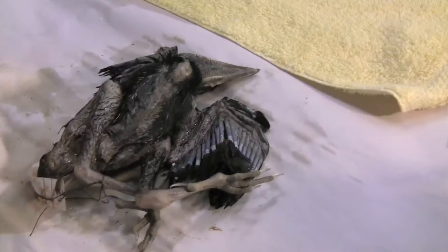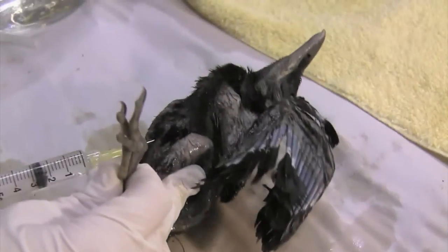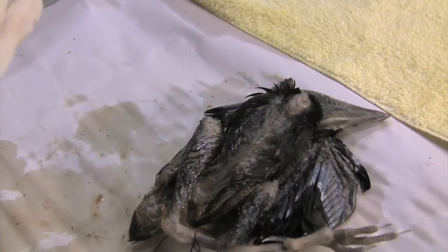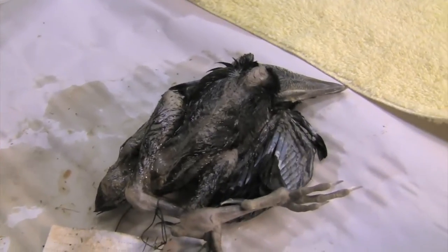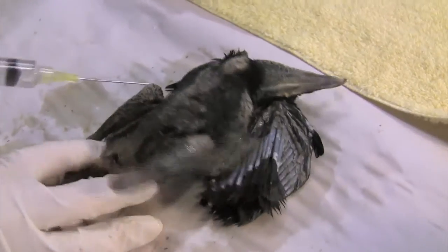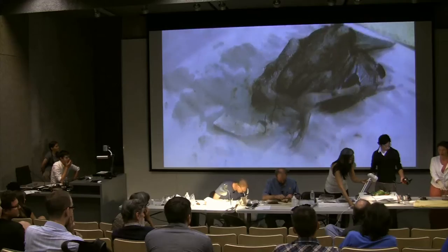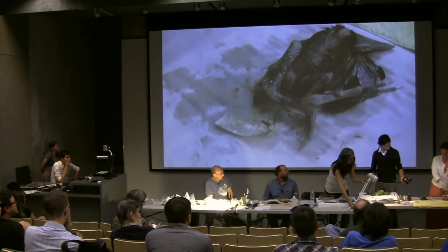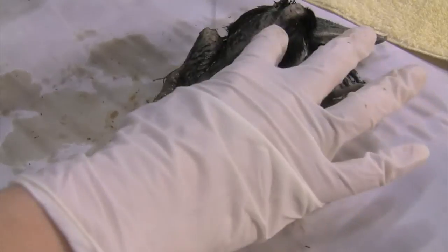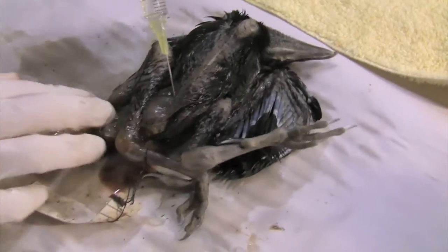I've done both legs; now I'll do the pectoral region. This is a nestling, so not a whole lot of pectoral to get into. Also, if you've taken a tissue sample from the pectoral, one of your muscles is already open and therefore is going to be totally exposed to fluid anyway.